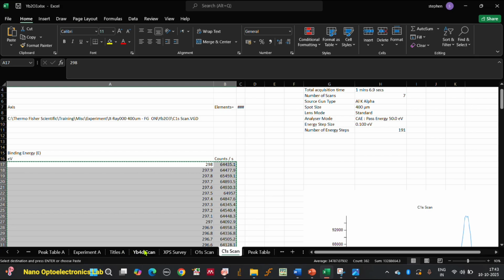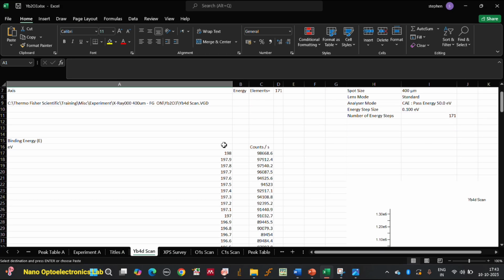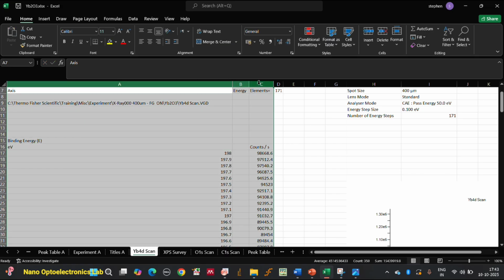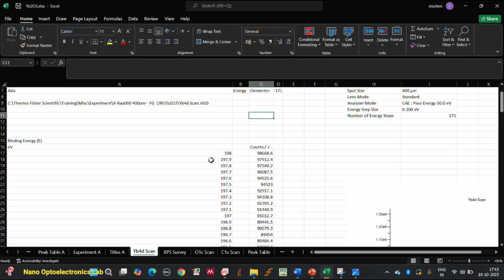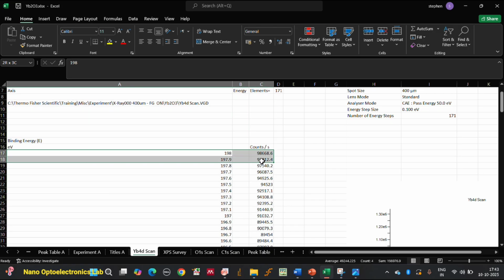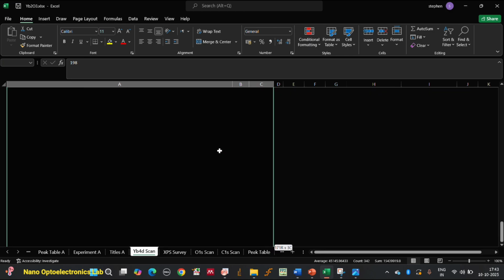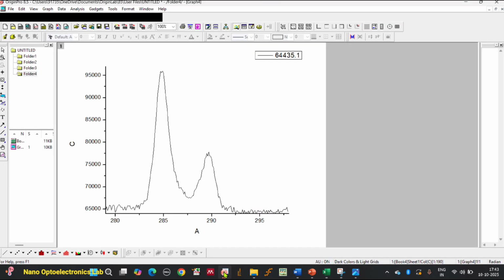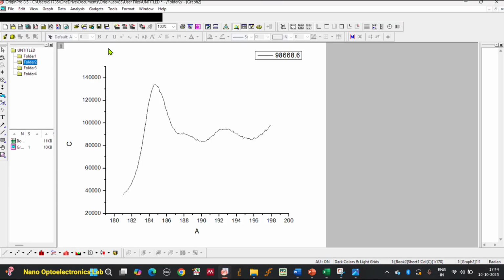Now I am going to take the Yb4d data and copy it, and we are going to take it into Origin.